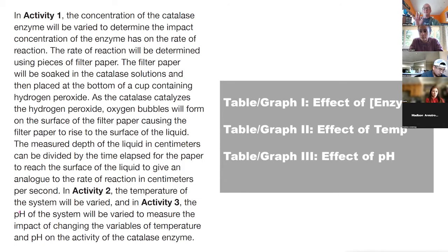So read the instructions really carefully, because I know everyone's read the instructions before starting the lab, right? If you'll notice, there are a lot more steps than we're used to, like 20, 30, 35 steps. So you've got to read them really, really carefully. So the first one, we're just going to make a catalase solution.